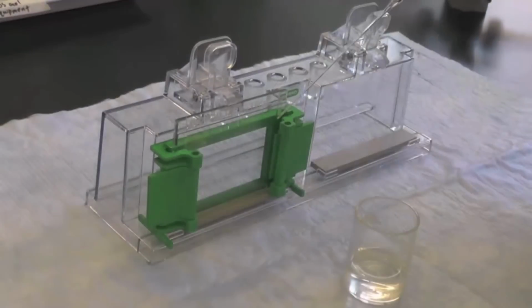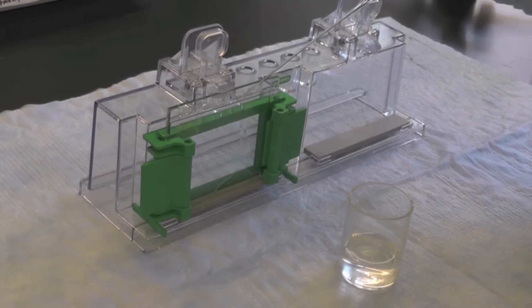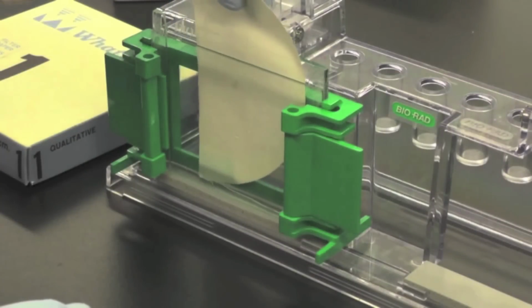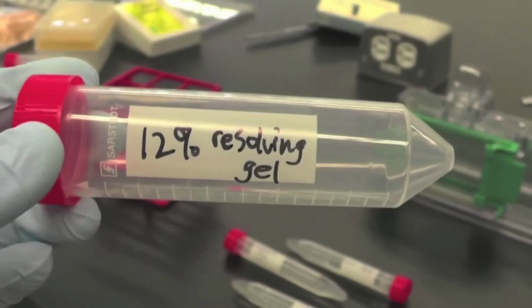Check the seal of your setup by pipetting DD water halfway up the plates. Observe if any DD water leaks. If there are no leaks, then remove the DD water either using Kim wipes or filter paper until it's almost dry. When the gel casting stand is set up, prepare the 12% resolving gel solution in a 50mL Falcon tube.